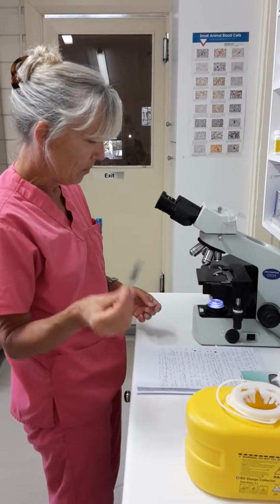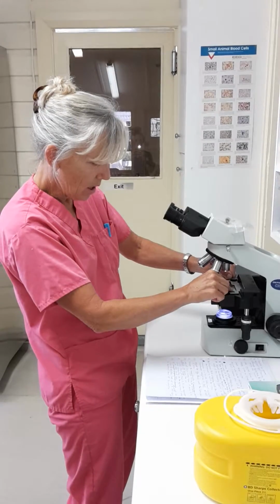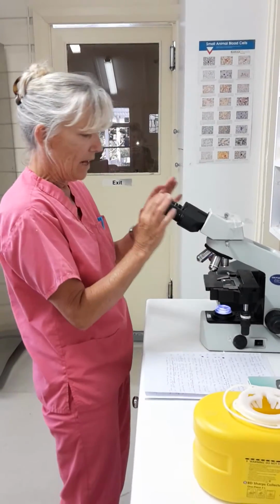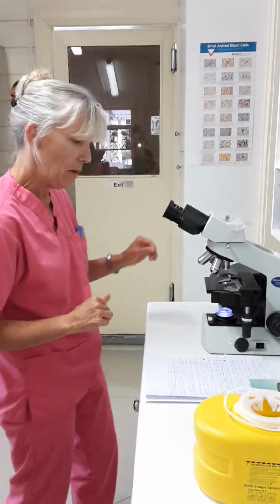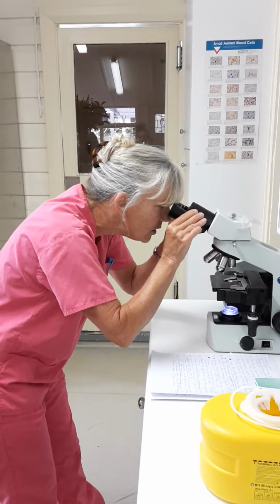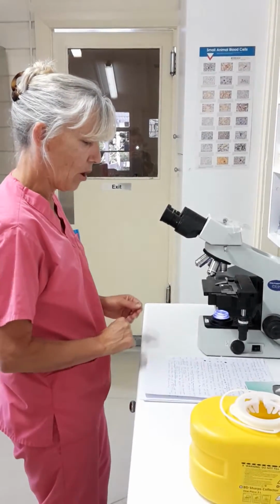We're going to place our slide onto the stage using the little arm, and this is the stage. So on goes our slide, and that's neatly into place. We then look down these things here, which are called the oculars, to have a look at our image, and then we adjust the interocular distance to our personal preference using these little bat wing things, so that we change two images into one. That's how we adjust it and know that it's right.